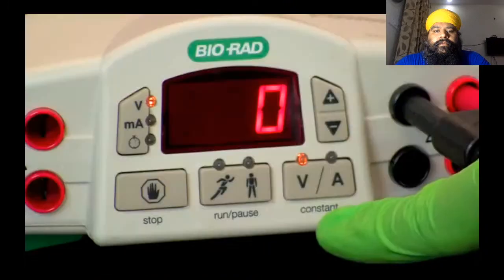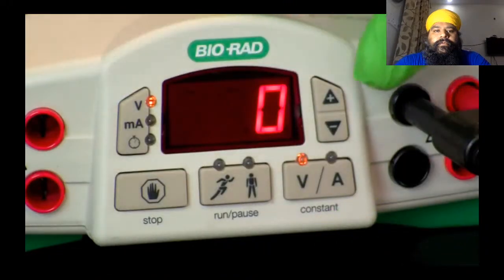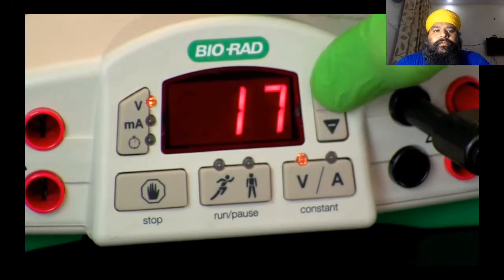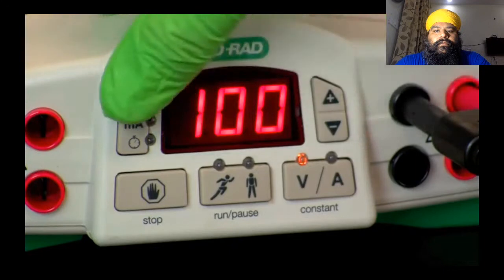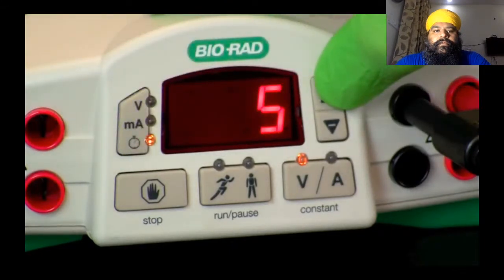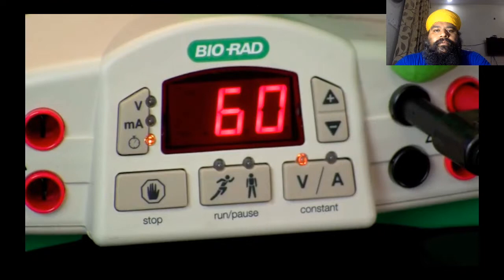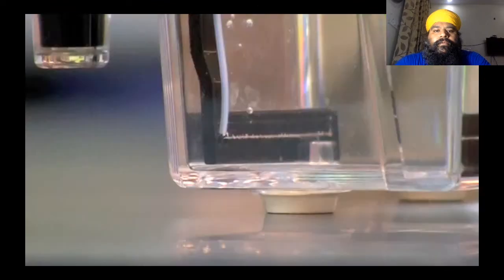Switch the power supply on. Then set the correct constant voltage for running the samples. See your lab protocol for this information. If a timer is available on your power supply, set the clock for the proper time for your run. Press the start button to begin the flow of current that will separate the DNA fragments.